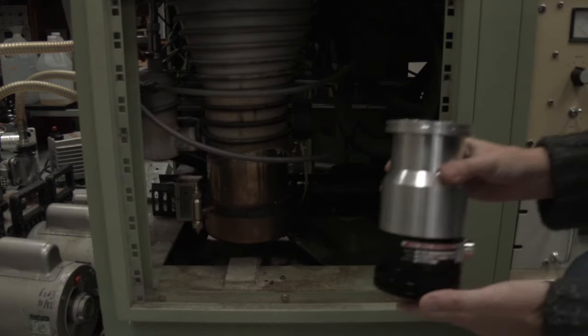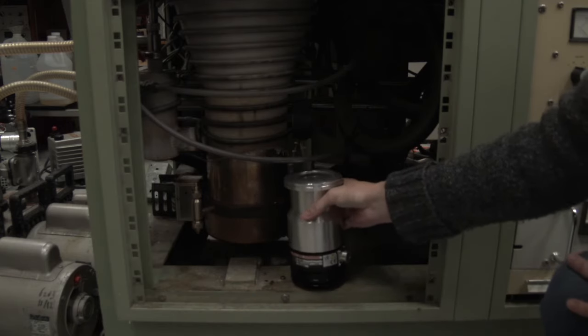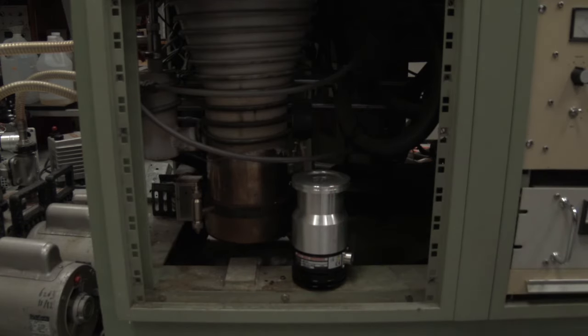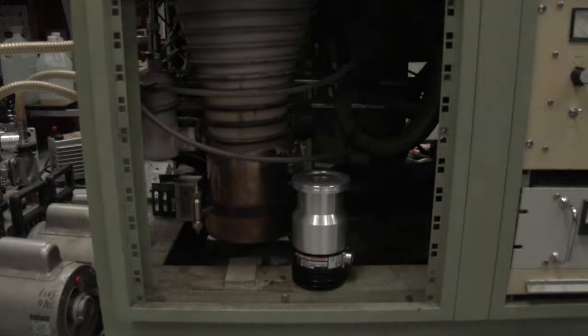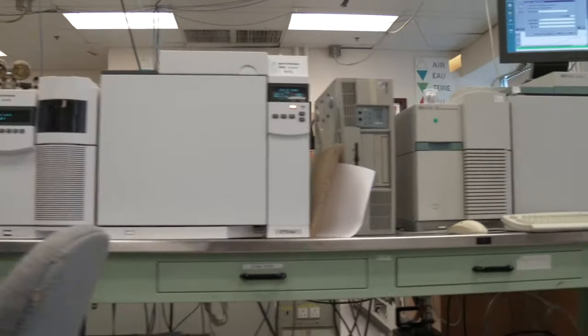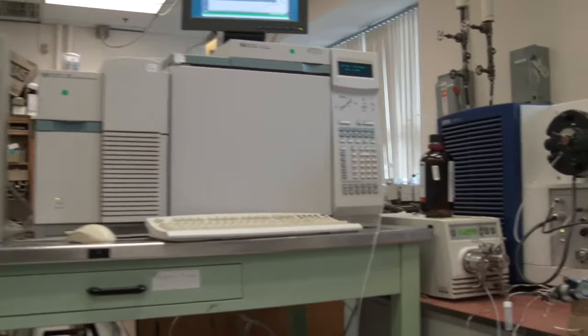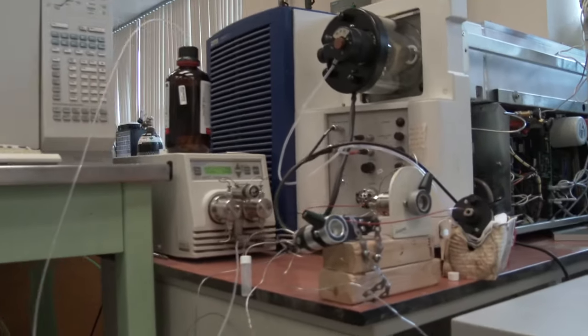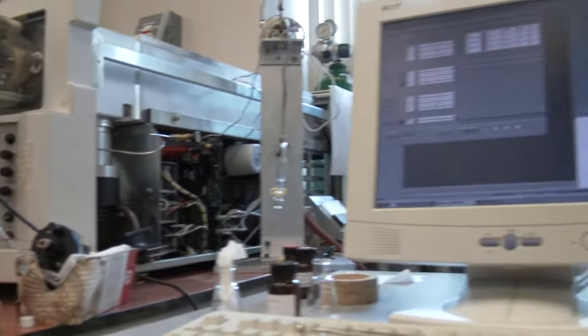Diffusion pumps can be relatively large, and consequently mass spectrometers were also large. The advent, however, of the molecular turbo pump has meant the mass spectrometers have decreased in size. Here is a molecular turbo pump. Look how we can compare it to the size of the diffusion pump. As we move around the lab, you can see in this space where we previously had one large instrument, we are able to accommodate now four instruments.